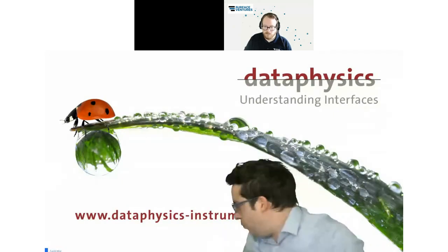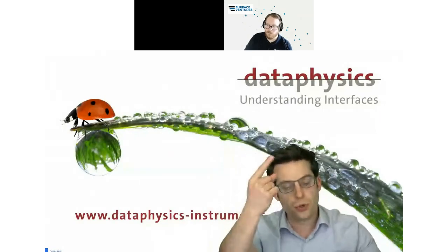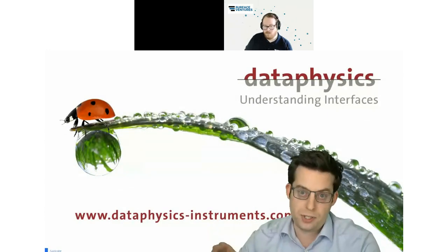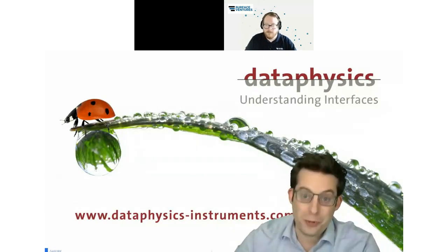If you have one implant like this one here and the other one has very big screw turnings and is conical over the complete shape, then it's very difficult to compare the numbers because they have such different geometries. So I hope this answers your question.